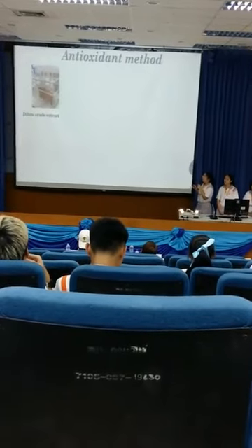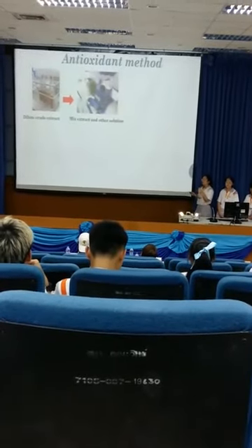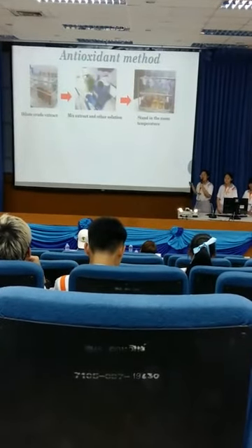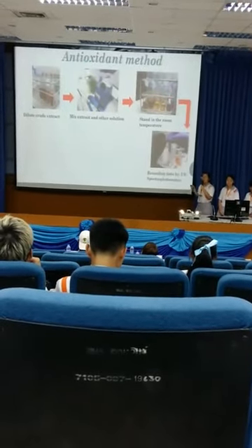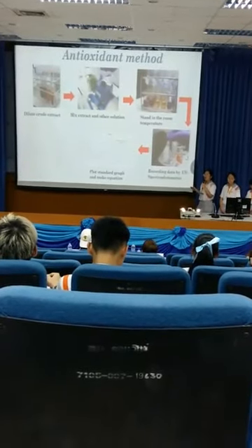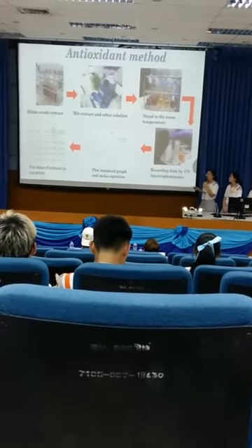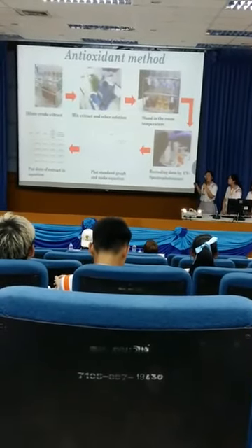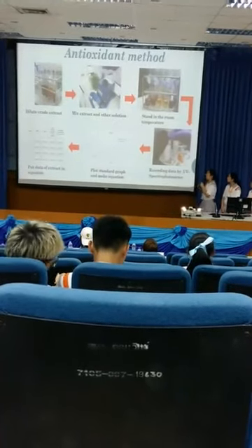First, we will dilute the extract, and then mix it with the solution and leave it at room temperature, and record data by UV spectrophotometer for a standard graph and make an equation. Then we put the data of the extract in the equation to find the concentration of antioxidant in our extract.